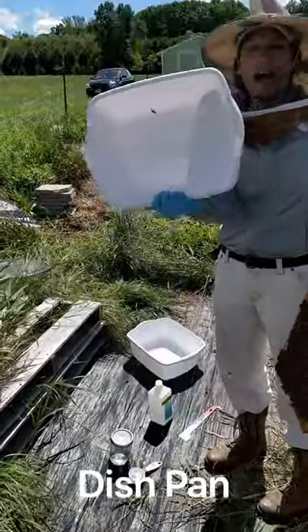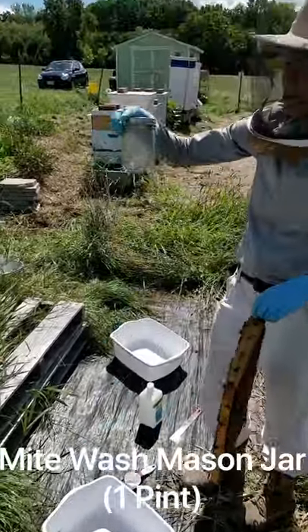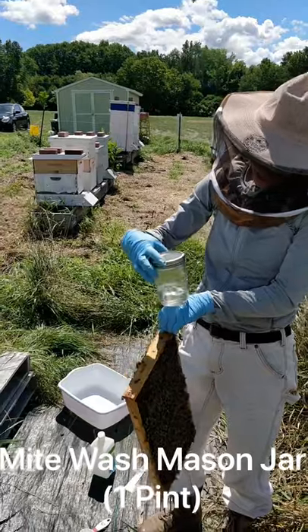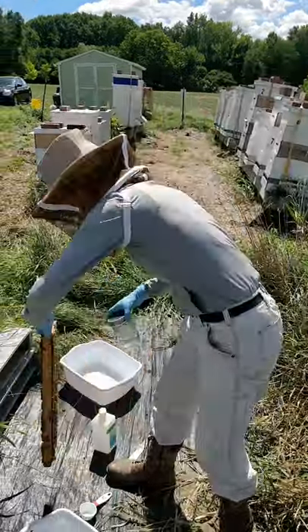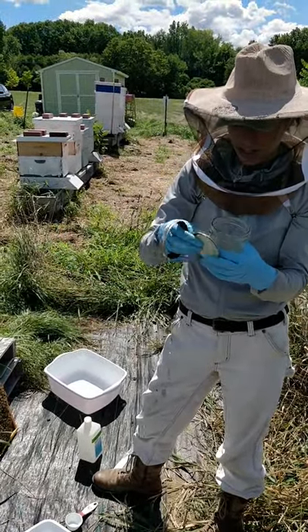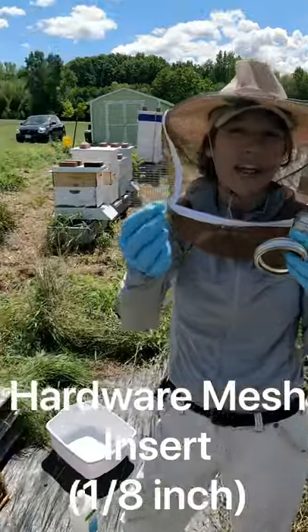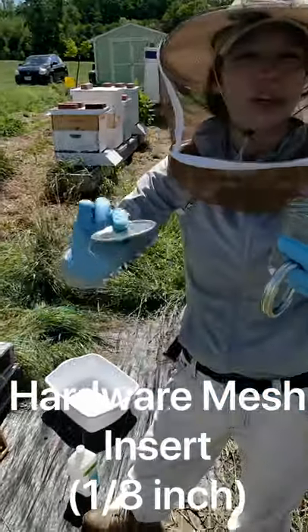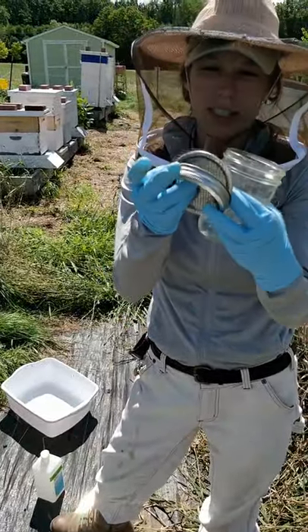I've got just a standard dish pan — a bin you can get at any standard store. I've got my wash jar, which is a pint-sized mason jar with a lid. This lid is special because I have the normal lid, and I also have this bit of mesh, which you can find at any hardware store — it's 1/8 inch hardware mesh. You just trace out the lid on top of it, cut it with scissors, and it fits right into your lid. It's going to allow us to separate out the mites from the bees, so it's really critical.